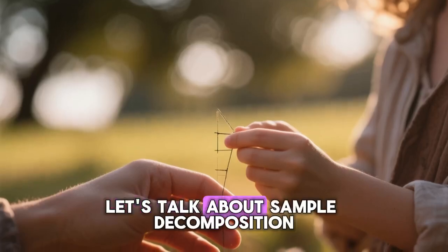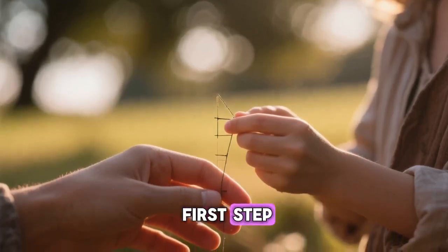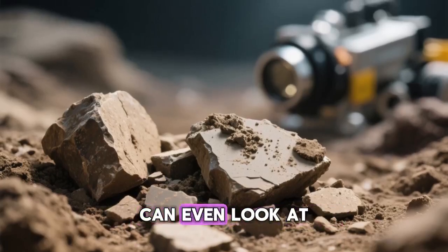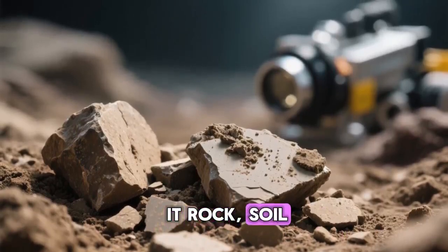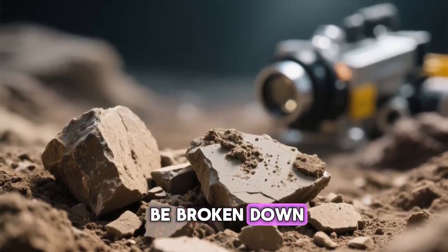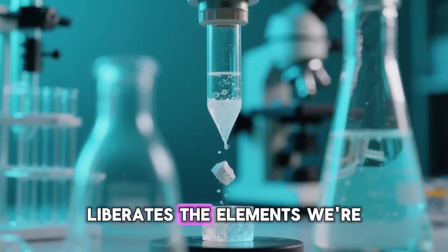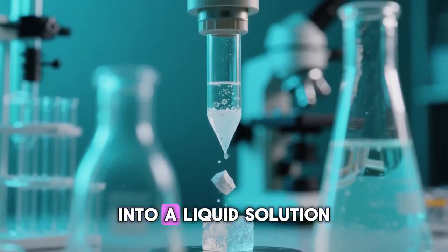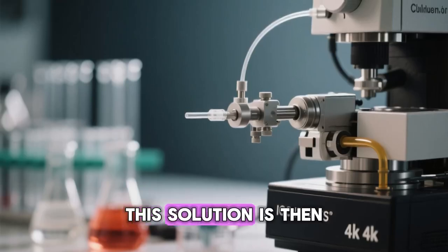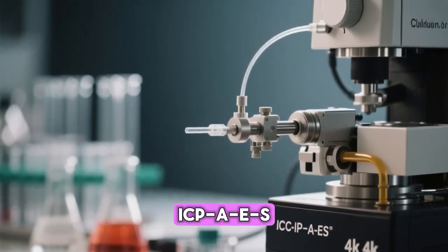First, let's talk about sample decomposition. This is the essential first step. Before most instruments can even look at a sample, the solid material, be it rock, soil, or sediment, needs to be broken down. This process, called decomposition, liberates the elements we're interested in, converting the solid sample into a liquid solution. This solution is then ready for instruments like ICP-MS or ICP-AES.